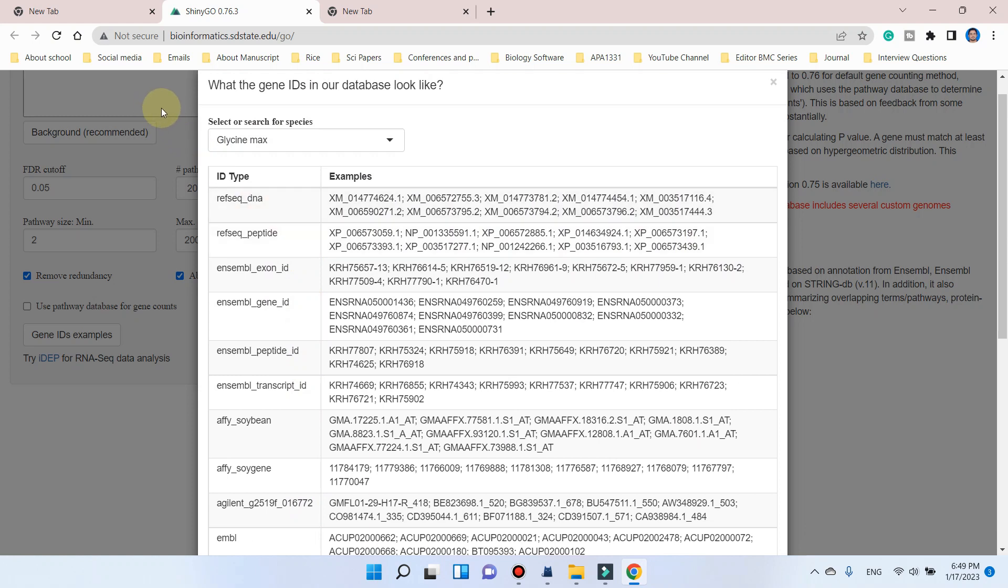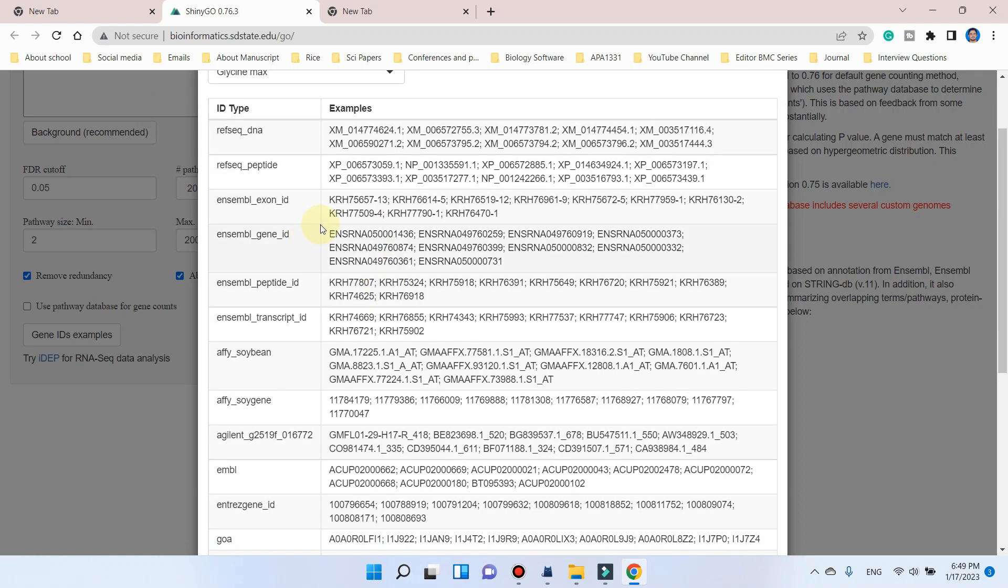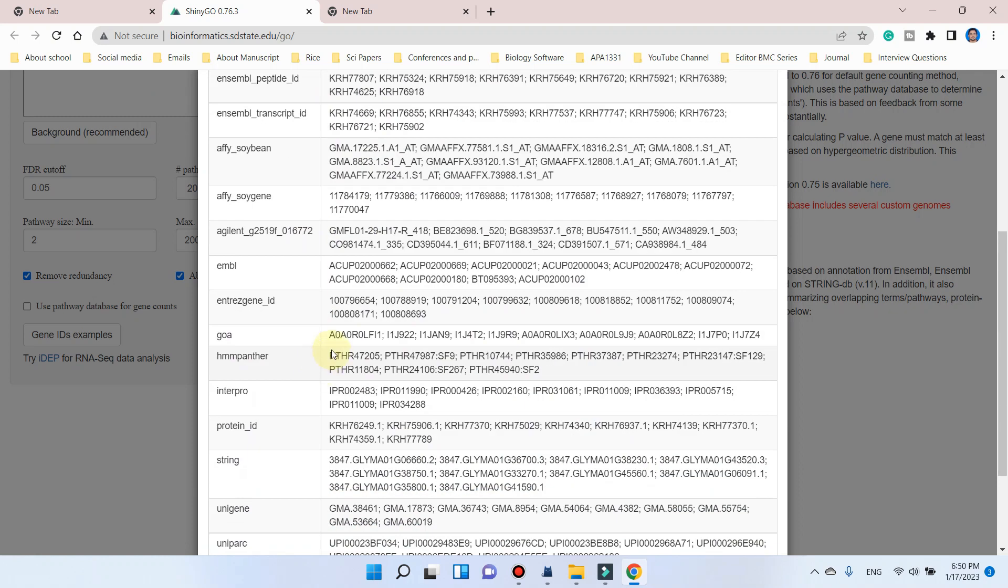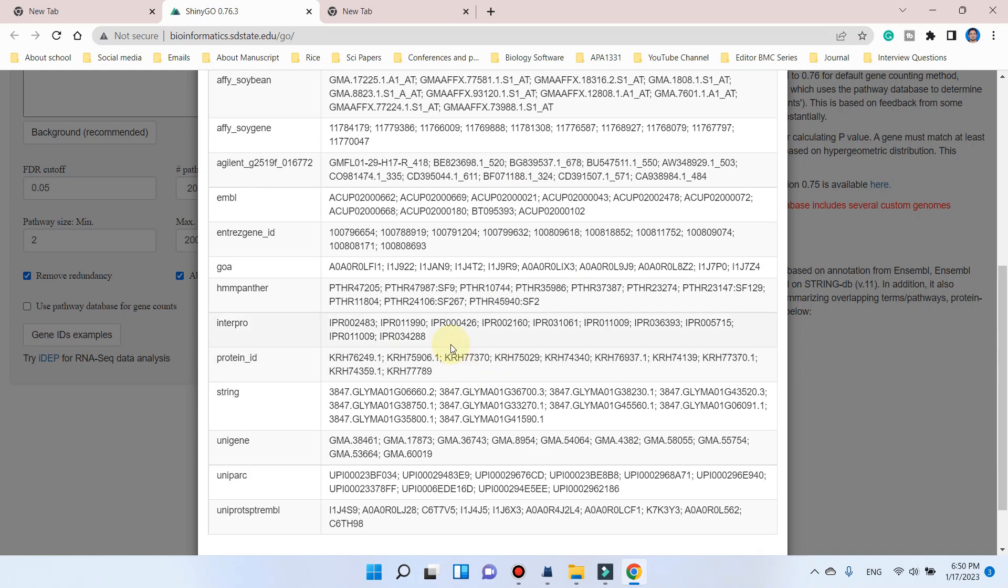It means that if you want to perform gene enrichment analysis using this ShinyGO tool, first you need to convert your gene IDs to any of these formats. For this, if your list is not big, you can change your genes one by one using BLAST tool or using any other ID converter tools. But at the end, you should have any of these formats so that your gene IDs can be accepted by this tool.